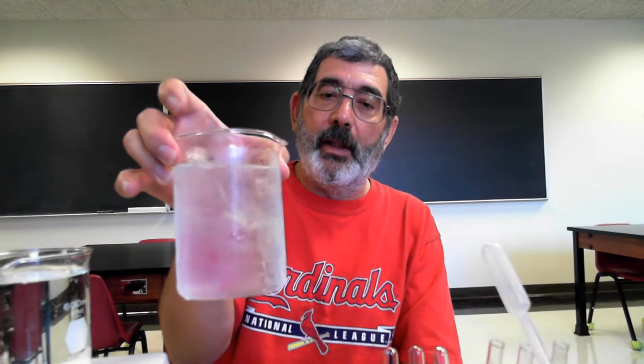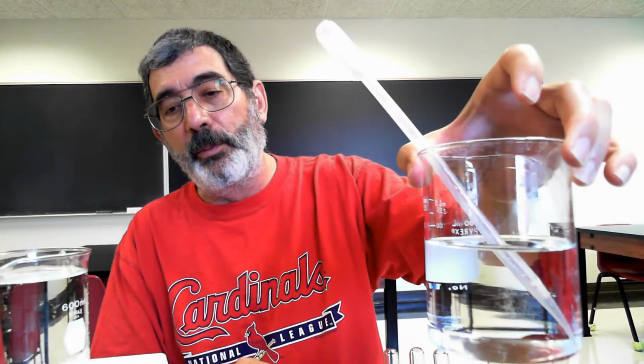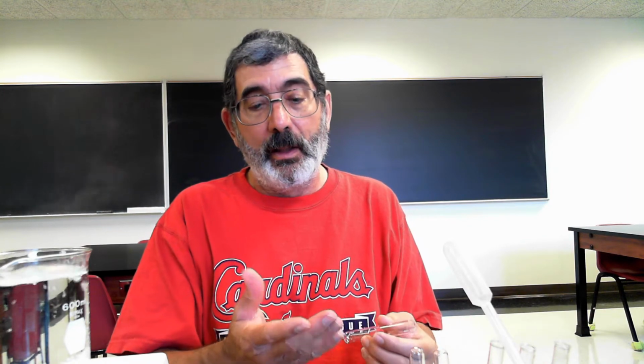In the second video for enzyme activity, we're going to look at the effects of temperature on our enzyme. So we've got three different temperatures of water. Let me get this where you can see it. We've got this boiling hot water. We've got ice cold water. And we've got room temperature water. And so we're going to see how these different temperatures affect our enzyme.